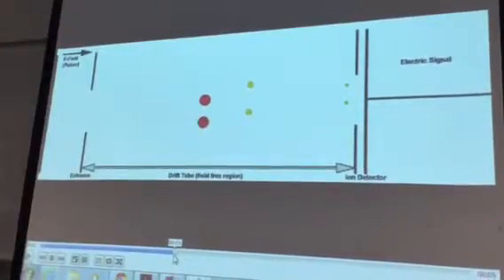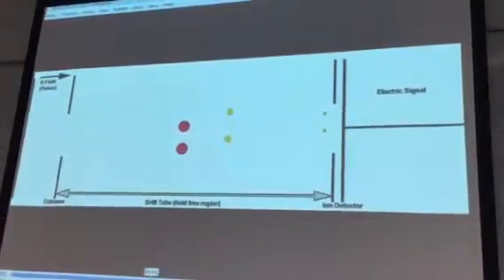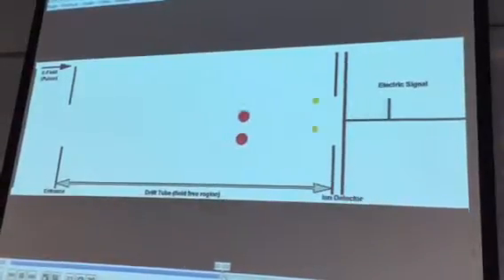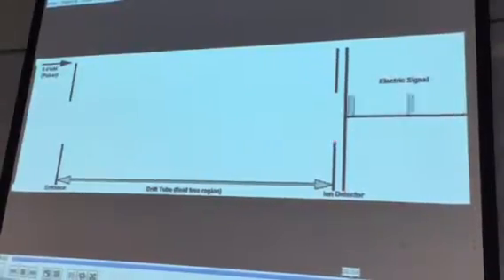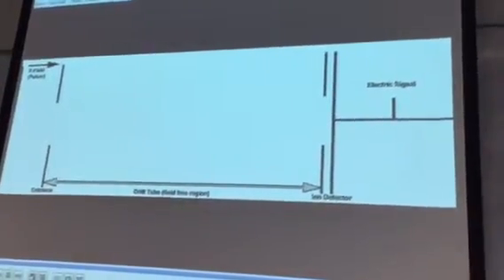What you'll see on the far right of the simulation is detector signal as a function of time. First you'll see your peak there for the lightest of the three, the green spheres. And there's a peak for the moderately massive yellow spheres, and then finally the most massive red ones. So you get a plot of detector intensity versus time.